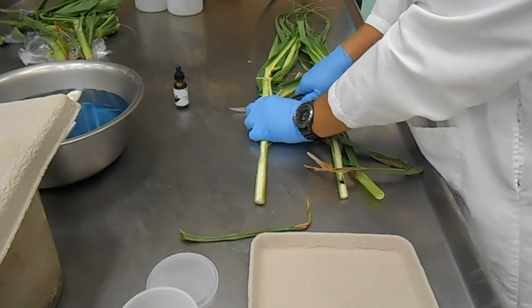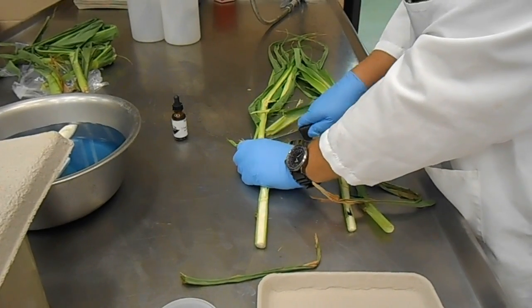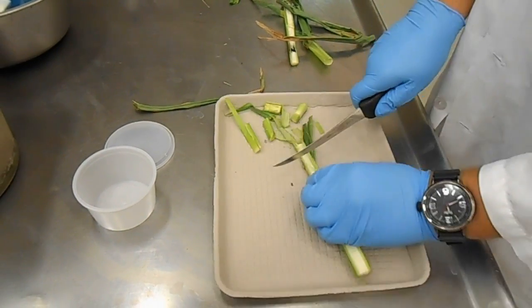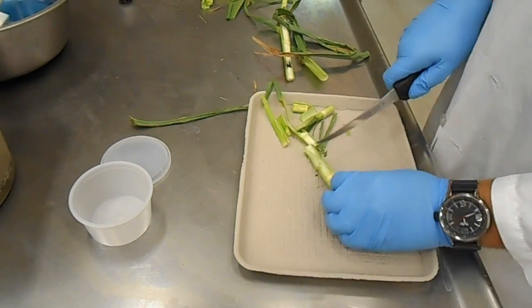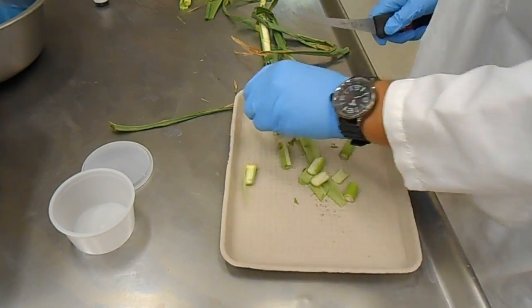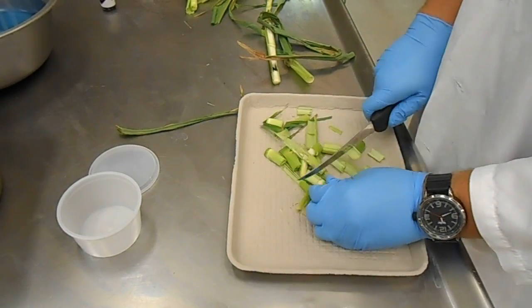If you have a positive nitrate test by the diphenylamine test, go ahead and chop up that portion of the stock and start preparing it for either the strip test or an in-lab ion chromatography test. The corn stock should be diced to achieve maximum homogeneity — similar to dicing an onion at home on a cutting board.